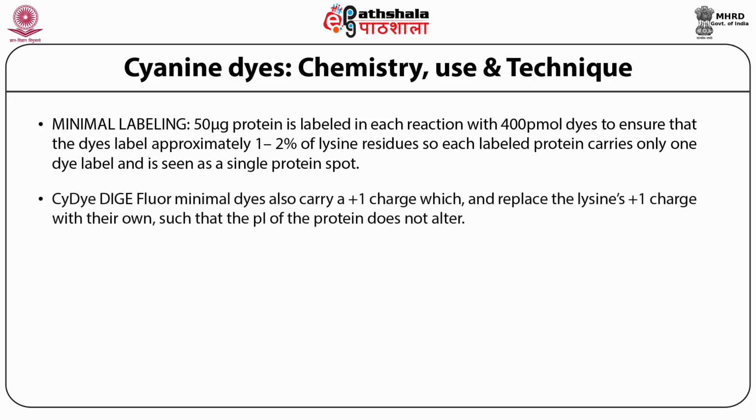Minimal dyes are intended for a general 2D application where sufficient amount of samples are available.